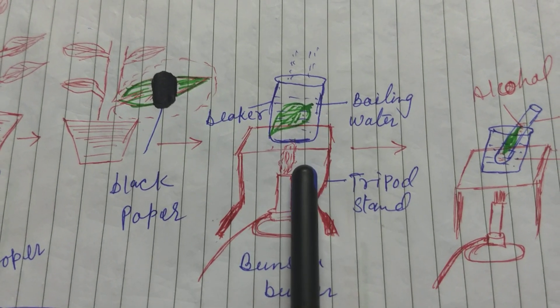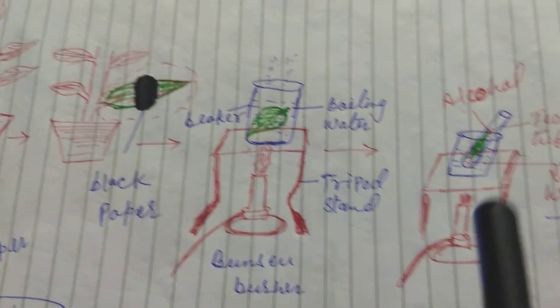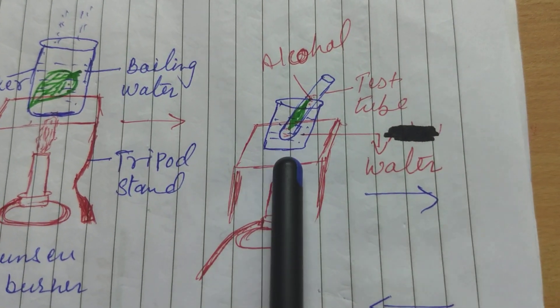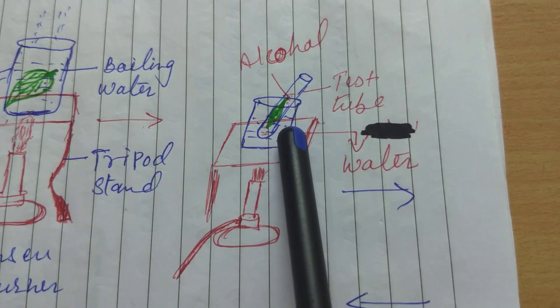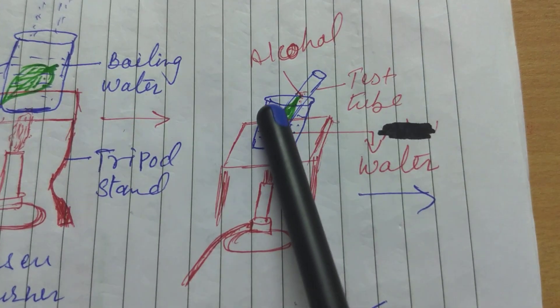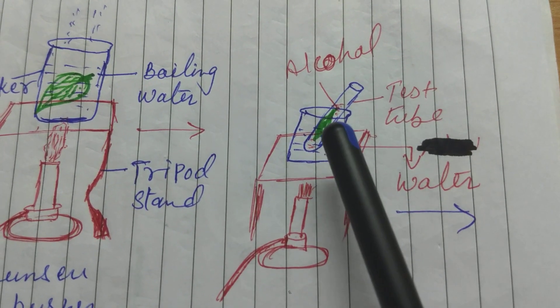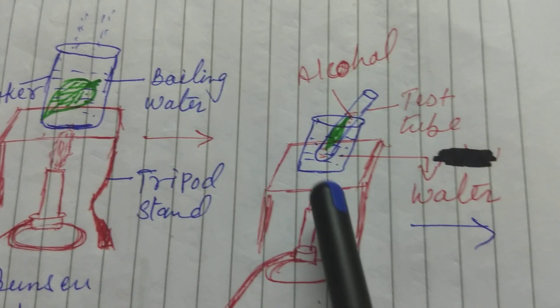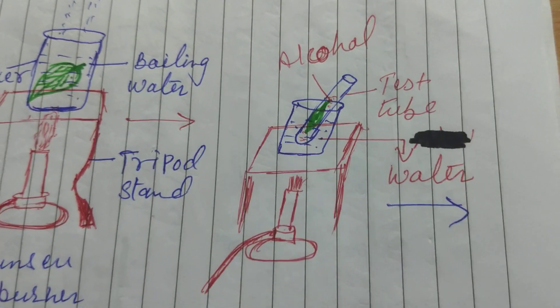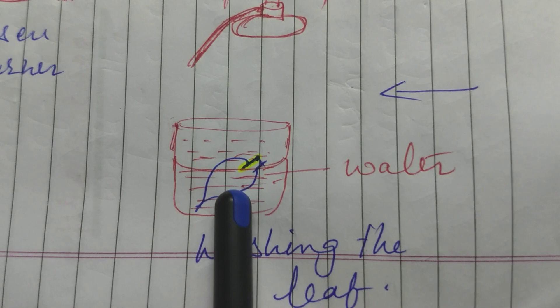We keep the beaker on the flame. Inside the beaker there is water and the leaf — we first boil the leaf in water. Then again we boil the leaf in alcohol. You can see the beaker is on the flame, with water inside and a test tube containing the leaf and alcohol. We cannot put the test tube directly on the burner with alcohol. After boiling, we take out the leaf from the test tube and wash it with water, then put it in a petri dish.